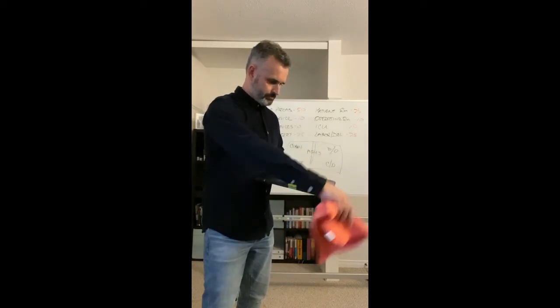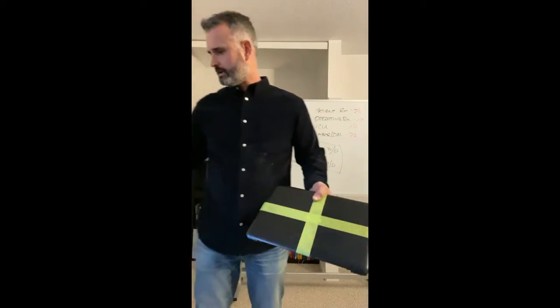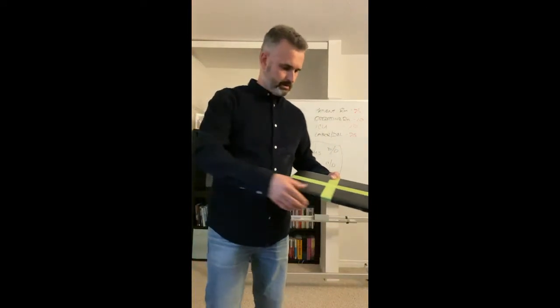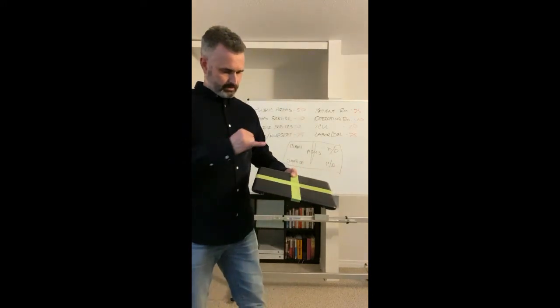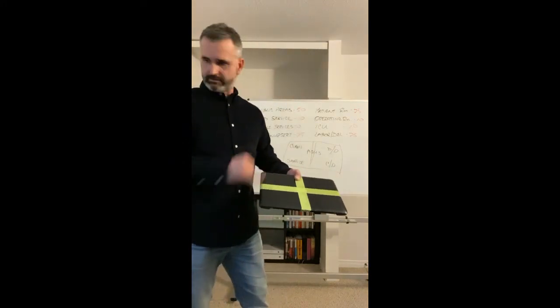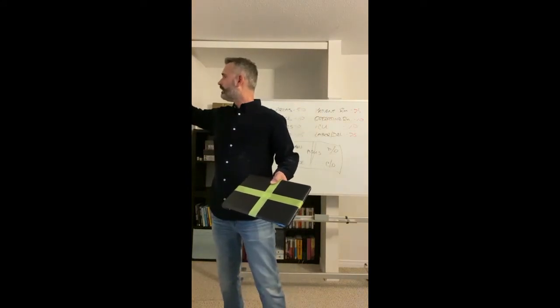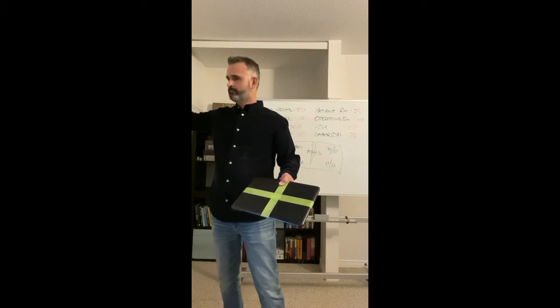I'm going to wipe it off completely. I'm going to give it a chance to dry on its own there. And then, in the meantime, we're going to take readings from these other two areas. And let's make sure we got good swabs here this time.